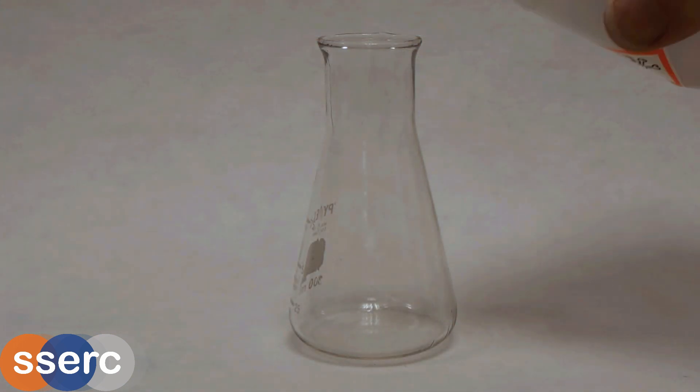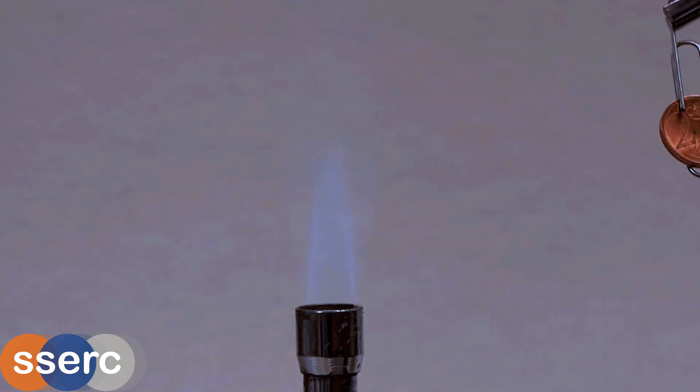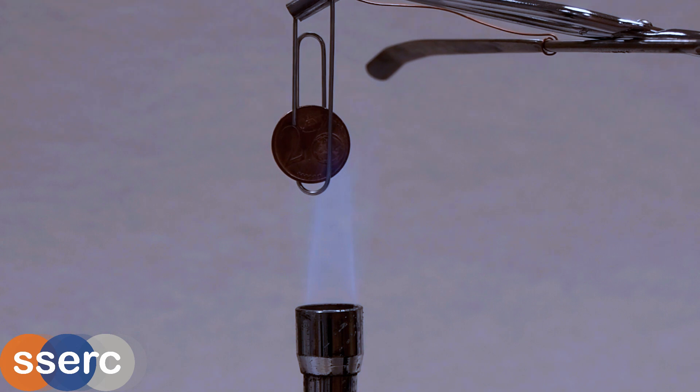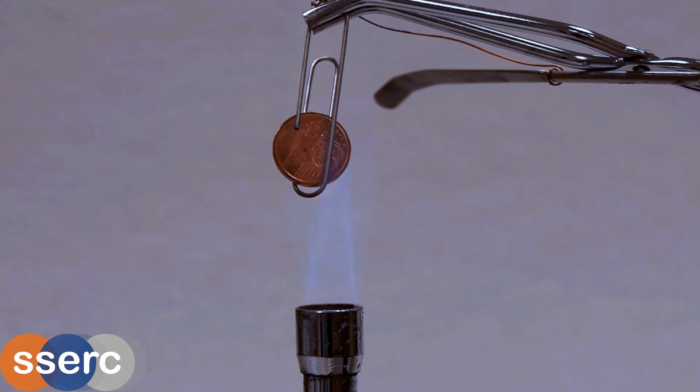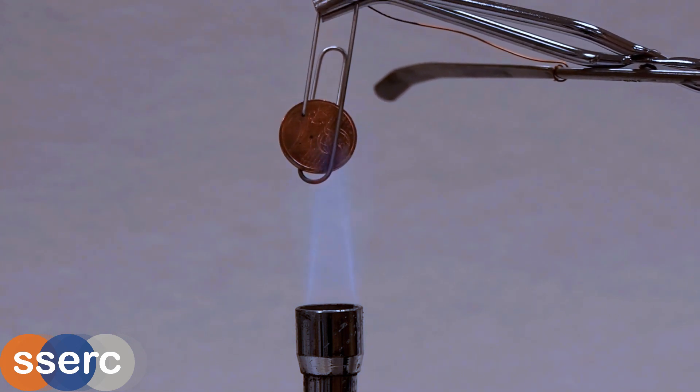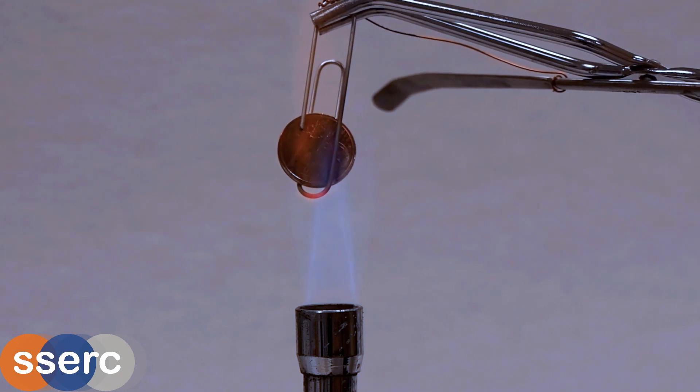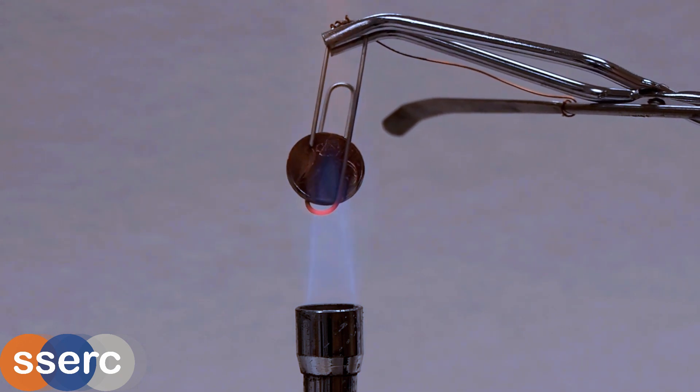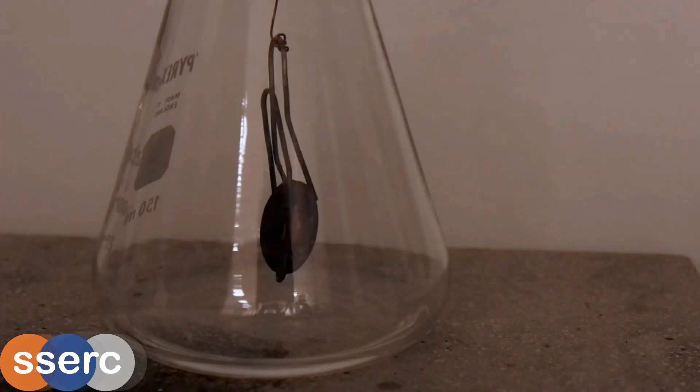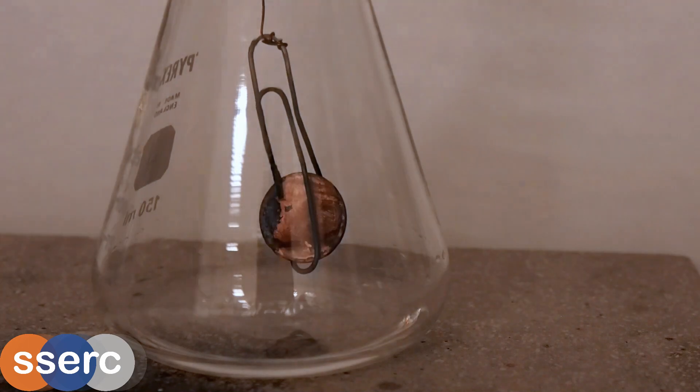Now we place some ethanol in the bottom of the flask and we are ready to go. We heat the copper coin strongly until it is close to red hot. Now take the coin out of the flame and as quickly as possible dangle it in the flask filled with ethanol vapor. The spatula sitting on top stops it falling in.